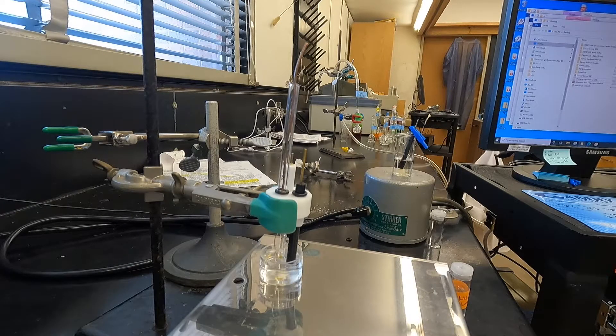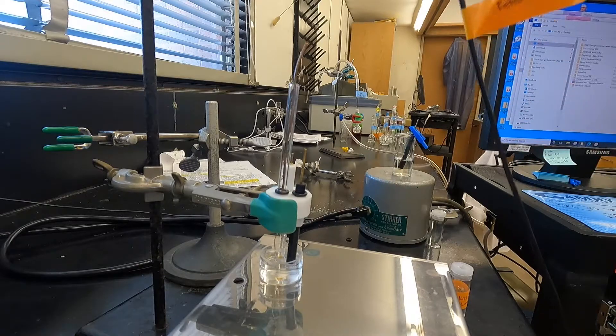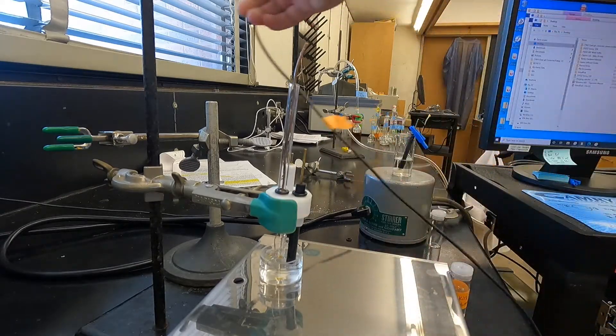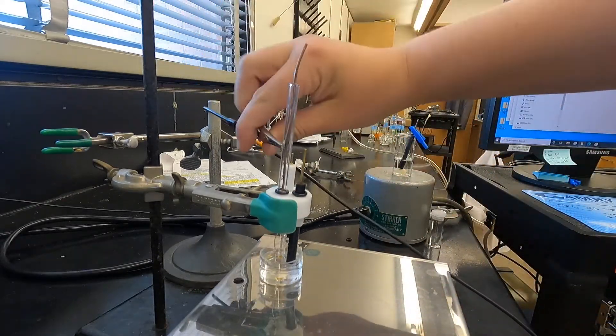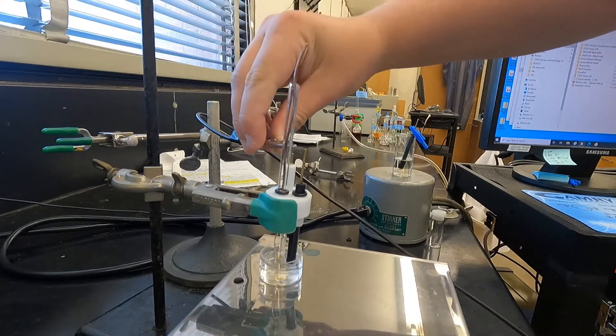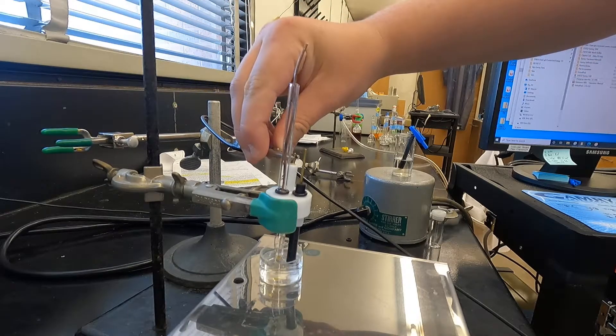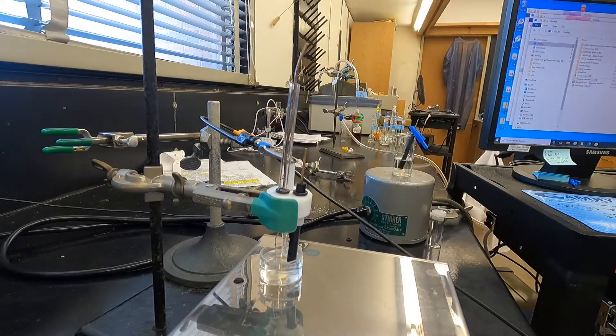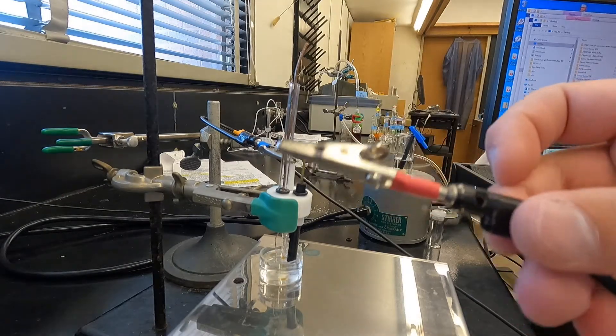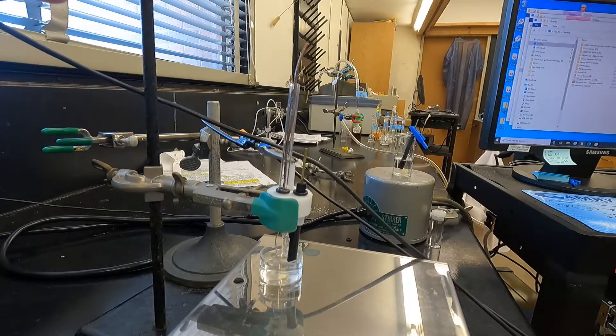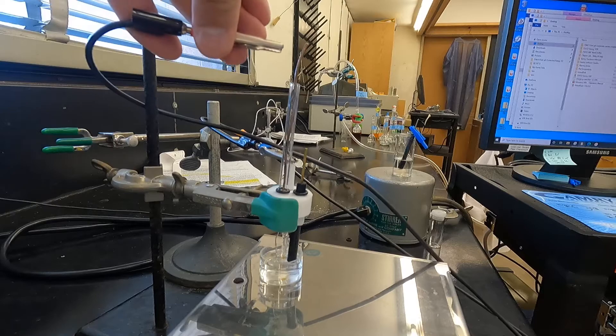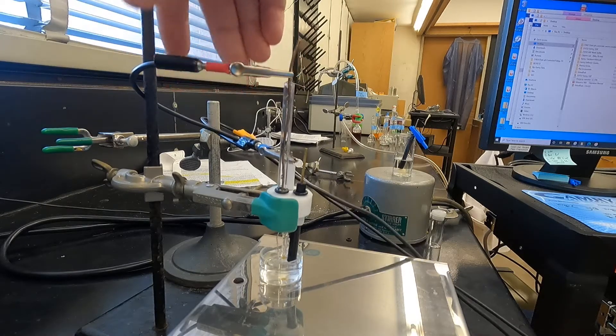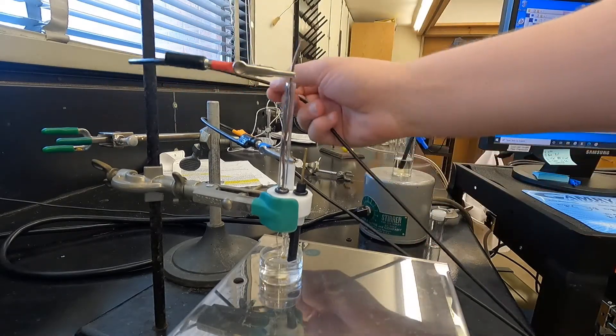Now we've got our cell all set up with a gold working electrode. You're going to plug your silver silver chloride reference electrode in first, and then the counter electrode is a platinum wire. It's very important to plug the reference in first just because that's what the system is expecting, but it doesn't matter the order that you plug the other two electrodes in.